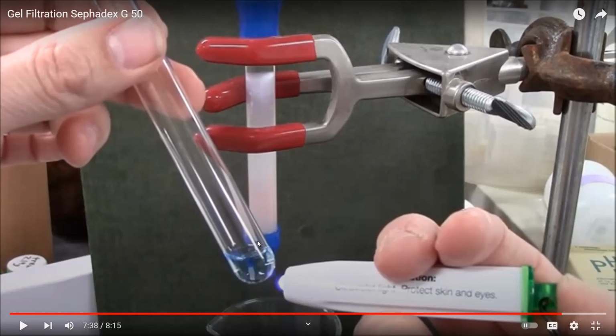Now, proteins or any other biomolecules without color, how are you going to analyze them? So you're going to collect the fractions as he did, and then you're going to probably take them for UV spectrophotometry. Okay, if it is a protein, if it's a nucleic acid, you know that if the UV light passes through it, you'll get the absorption readings, and then based on that, you will be able to decide. So for the colorless solute or analyte, UV is the best way to analyze whether you have separated your analyte or not.